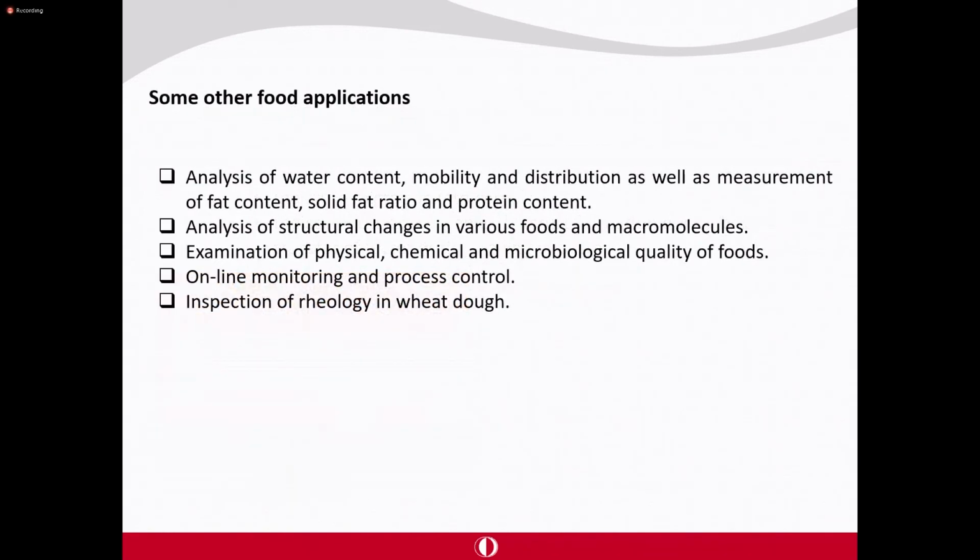Analysis of water content, mobility and distribution, as well as measurement of fat content, analysis of structural changes in various foods as macromolecules, examination of physical, chemical, microbiology quality, online monitoring and process control, inspection of rheology, like in dough materials, for instance, relaxation times can be used.